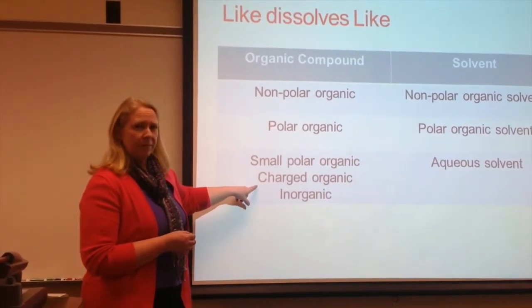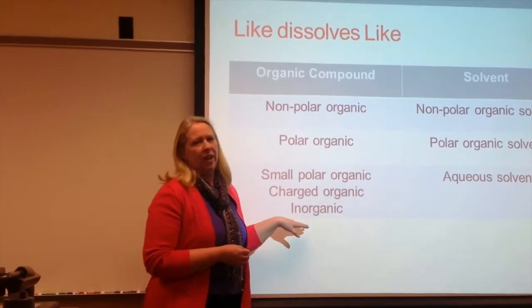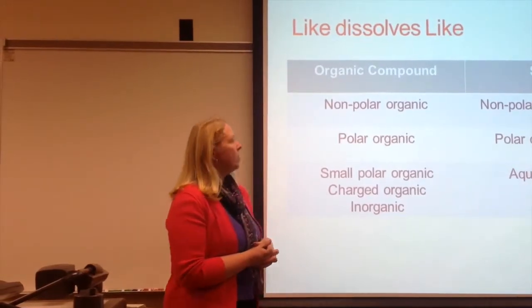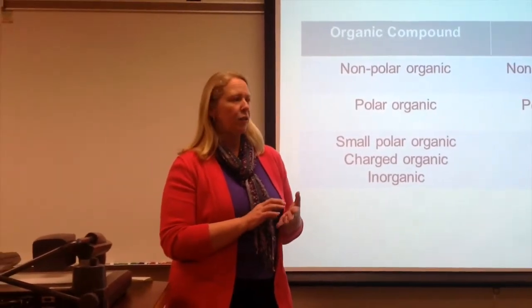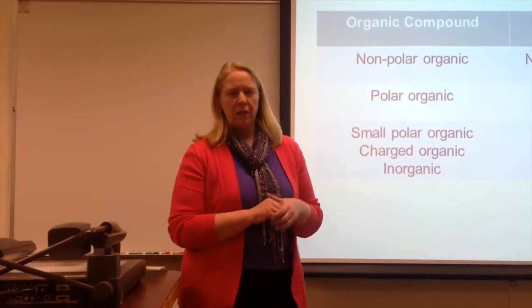Charged species. And this is what's going to come in handy today. And then, of course, inorganic compounds, right? Small salts like sodium chloride are readily soluble in aqueous solvents. So we're going to build on this principle, and not only today, but in other labs as well. You're going to use the same solubility principles for crystallization, which is upcoming.